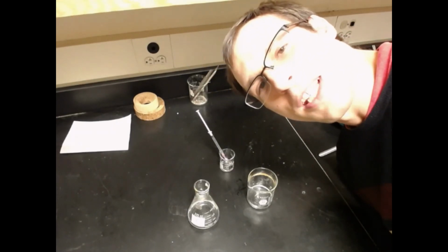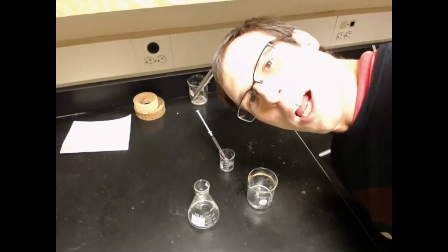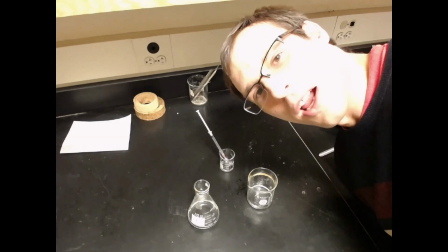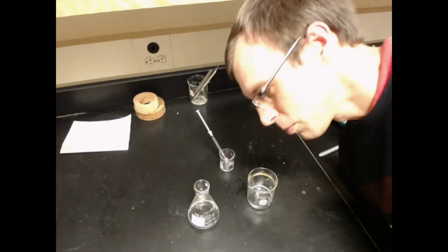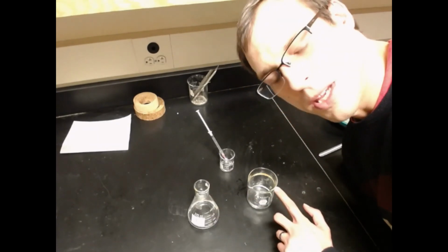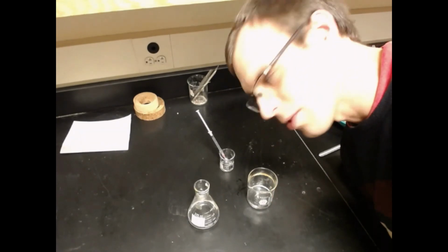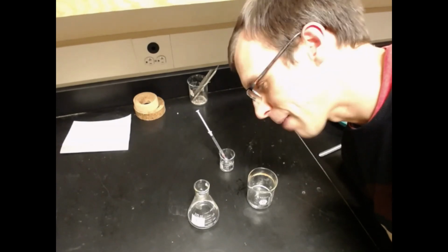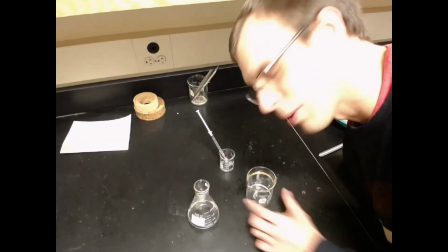I'm going to show you what this experiment looks like now. I have to lean over to say hi because I got the webcam pointed down so you can actually see the reactions going on. So what we have here is an Erlenmeyer flask and beaker. These are our two parts of our reaction. This is mixture 1, according to experiment 2 in the lab write-up. This is the first part and the second part that we're going to mix together.